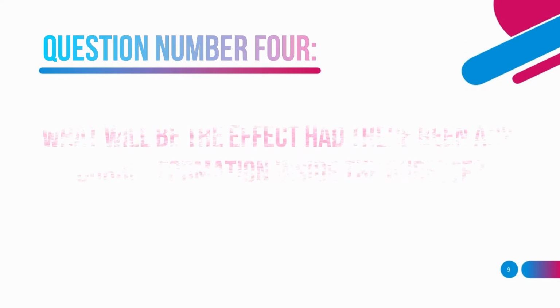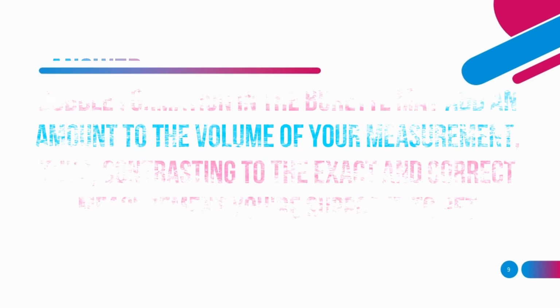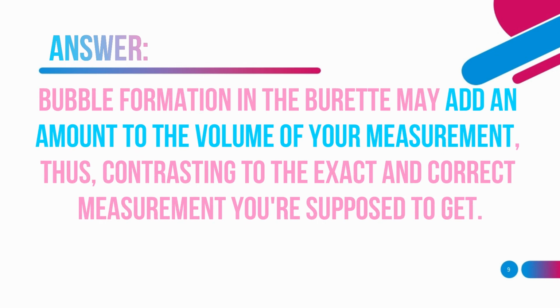Number 4. What will be the effect had there been any bubble formation inside the burette? Bubble formation in the burette may cause an added volume to your reading, thus contrasting to the accurate measurement you're supposed to get.